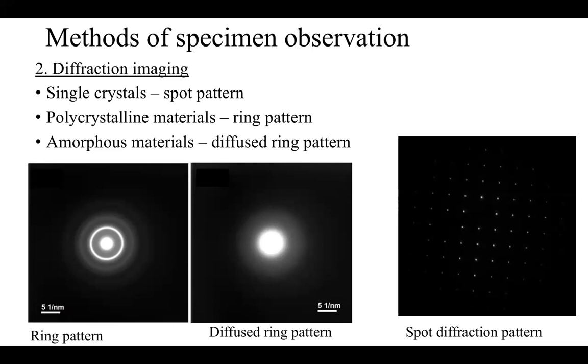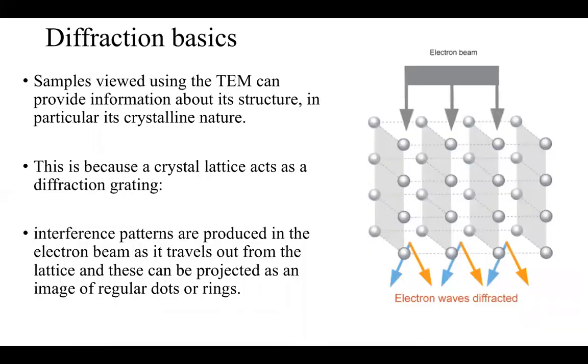So this SAED or diffraction imaging, we use in crystalline samples like polycrystalline or single crystal samples, but not for amorphous samples or biological samples. So, the diffraction basics.